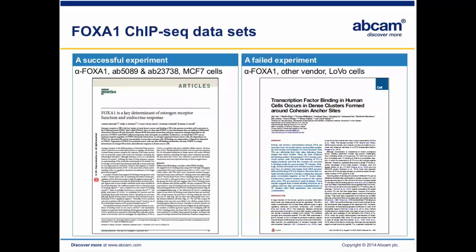The datasets I'm using here are FOXA1 ChIP-seq experiments. FOXA1 is a pioneer transcription factor, and it is one of the first transcription factors that have been ChIPed genome-wide. We will do a side-by-side comparison of a successful FOXA1 ChIP-seq experiment and a failed one.